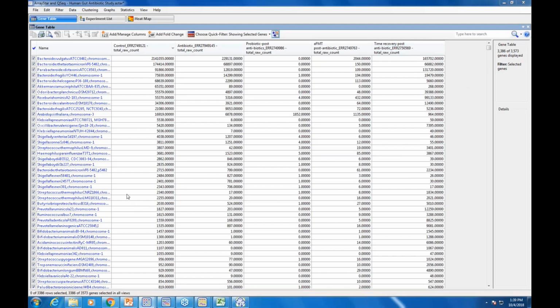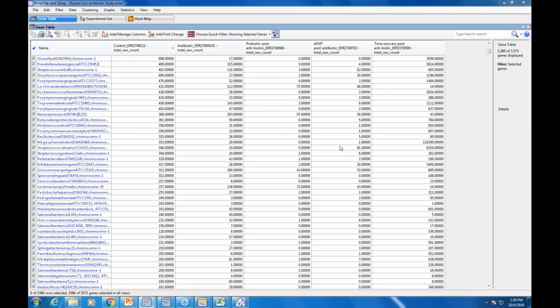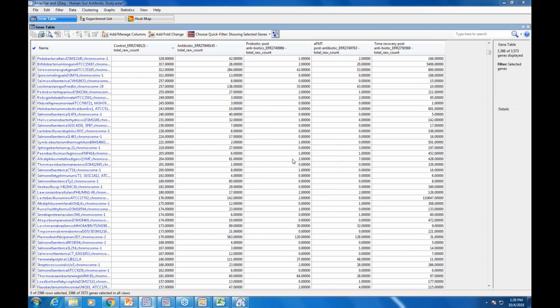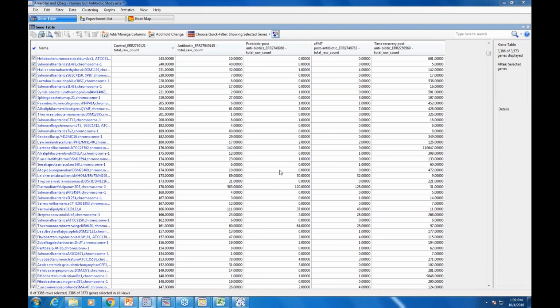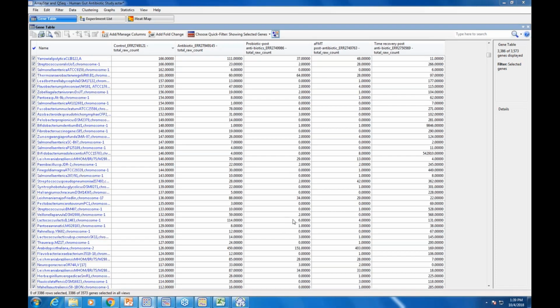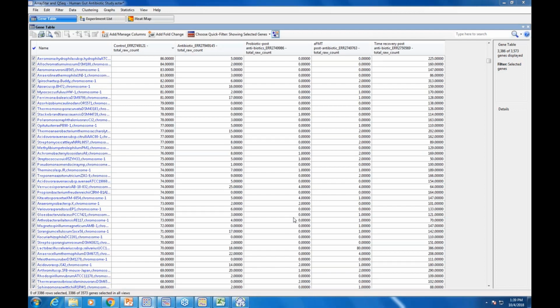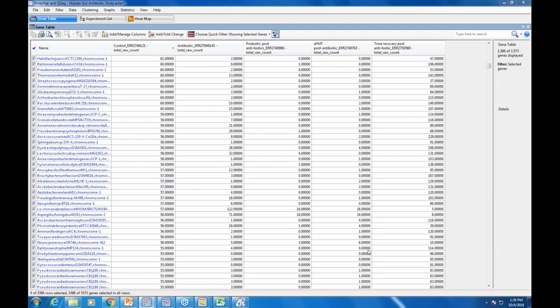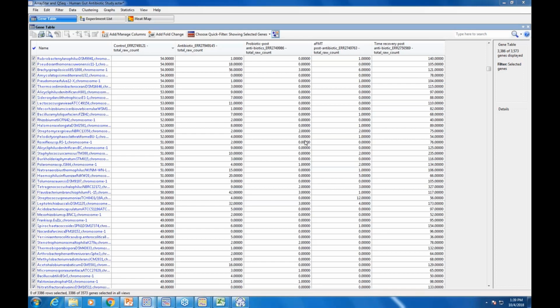And as I scroll down, I'm looking at some of these other columns, and as I look at, say, probiotic, you can see that you're purposely ingesting different types of bacteria or yeast, and some of those pop up. I can see them as I scroll down where some things start showing up, like this lactobacillus, you see it show up in the FMT control. And so certain things that you would expect to be in a probiotic will pop up in some of the samples more than others.